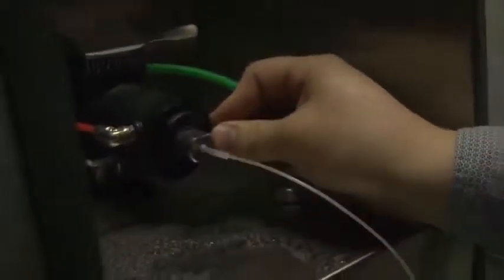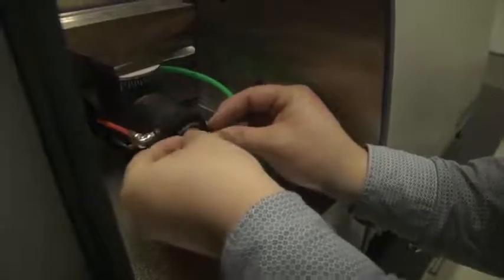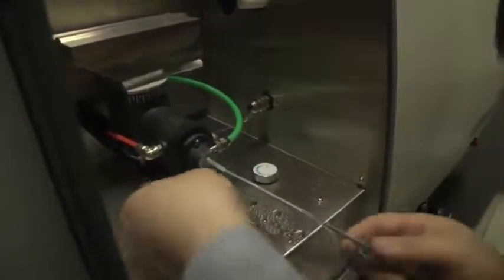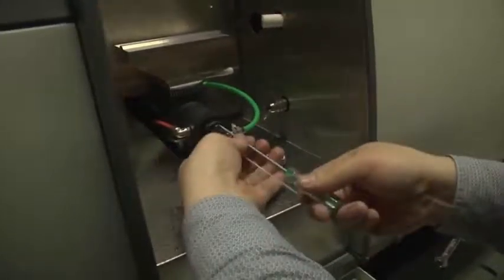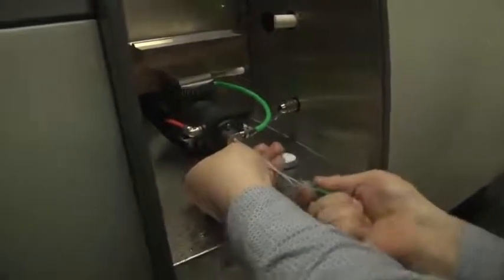Gently put the nebulizer inside the mixing room. Make sure not to touch the inner wall of the mixing room, because the nebulizer is fragile. Then put one screw into the nebulizer and fix it with a screwdriver. Put the other screw in and tighten with the screwdriver. Tighten both screws to make sure the nebulizer is in the ideal position.